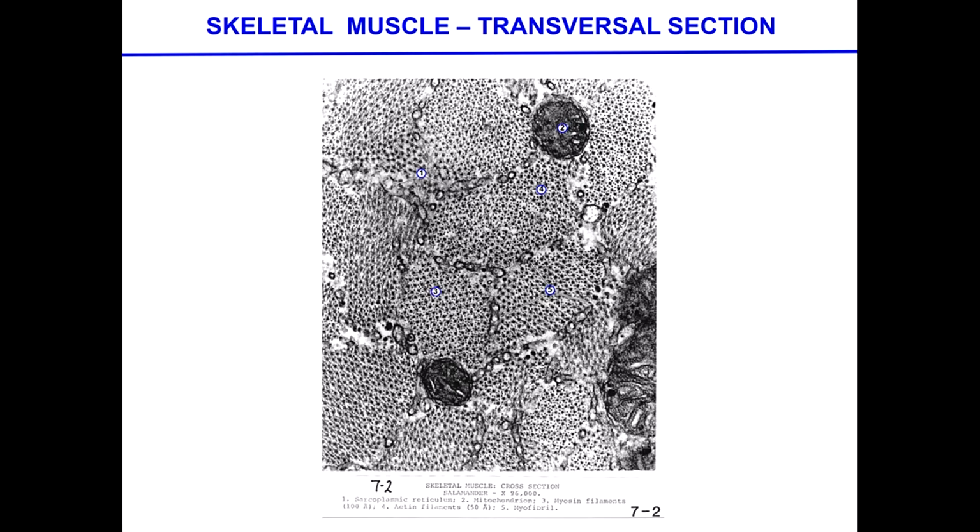Now, sometimes the perfect view gets slightly distorted, and I want you to know about that, because when you do the cutting of the tissue from the organ and the sectioning by the microtome, occasionally there is some pulling rather than a perfect cut section. So in some cases, the structure is not as beautiful as in the books, but you can easily see the two types of filaments.